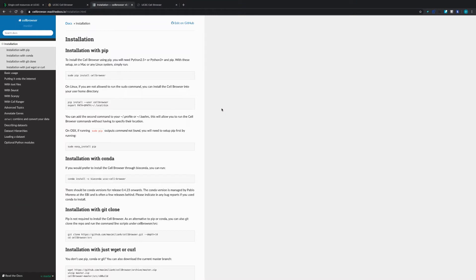It has all the details about how to install their package, what kinds of inputs you need to provide, how to write the script, and how to generate the cell browser. Now let us see what we can do with this UCSC Cell Browser.